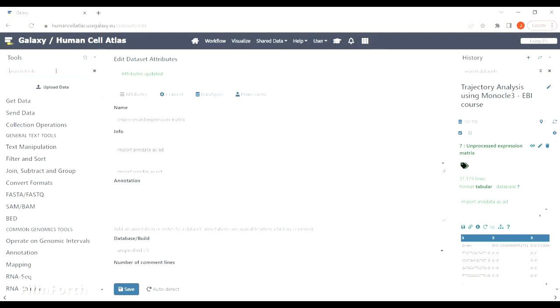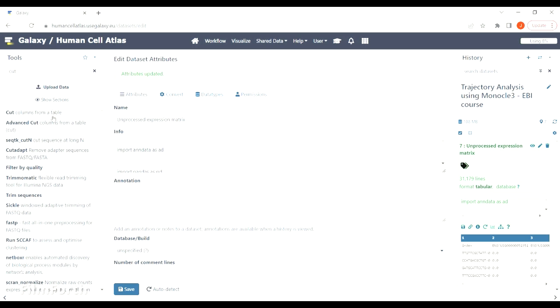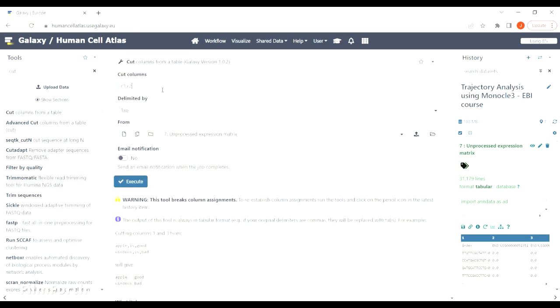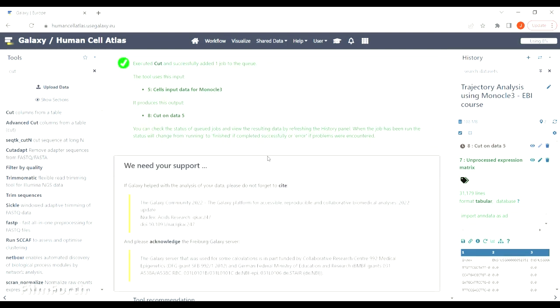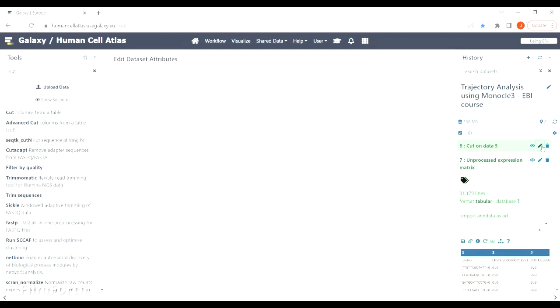Let's get the genes and cells IDs from the files we've already prepared as input files, and we'll do that by cutting the columns out of the files.